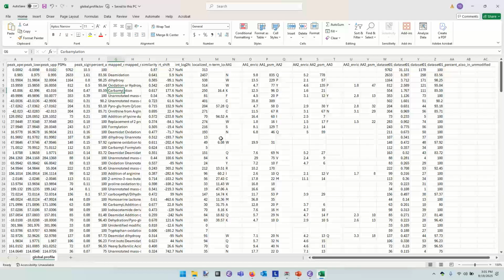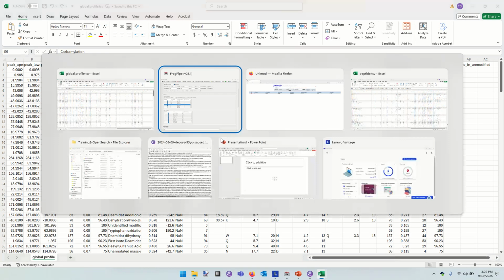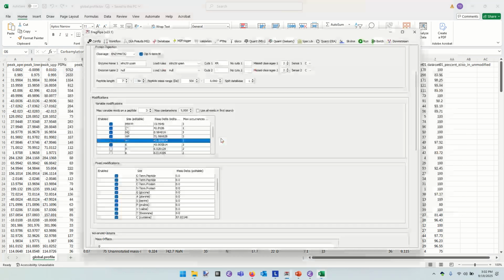The other way to look at it is that you're done adding PTMs to the new search when the search time or the search space becomes too extreme. The set of PTMs that we've already listed here are already pretty tough. This search is not going to take forever, but we don't want the search space to balloon out of control. So I think that this is a good place to stop with the set of modifications for now.